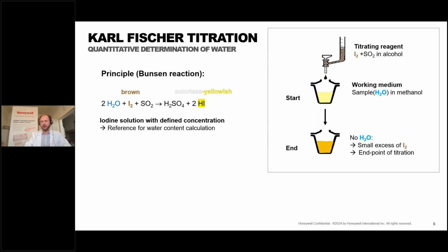Okay, this is the end point of the titration, and by using the consumption of the iodine solution as reference, you can then calculate the water content of the sample that was dissolved in the vessel.